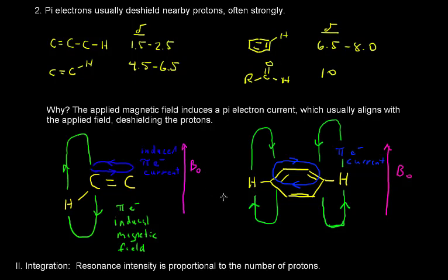The next thing I'm going to discuss now is the second type. We've talked about chemical shift, the factors that influence chemical shift. And chemical shift gives us very important structural information. It tells us the different types of chemical environments, the numbers of different types of protons that we have in a molecule. So each different type of proton will give us a unique resonance, and those resonances will be in regions that, as we see here, are characteristic of protons in unique chemical environments. So we get lots of structural information from chemical shift data.